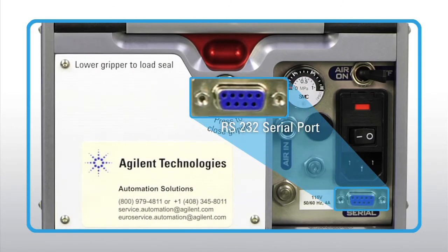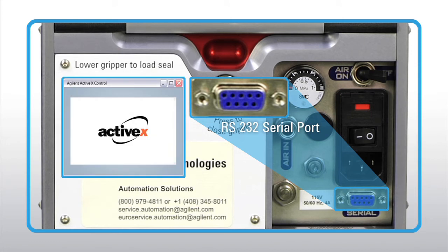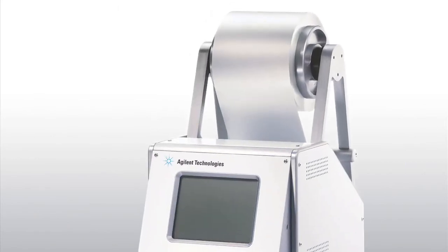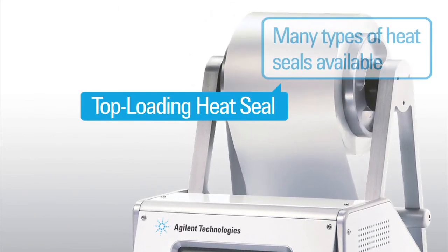An extended travel plate stage, RS232 serial port, and ActiveX control make PlateLock the ideal sealer for robotic integration. The EasyView top-loading heat seal support makes it easy to replenish the heat seal supply.